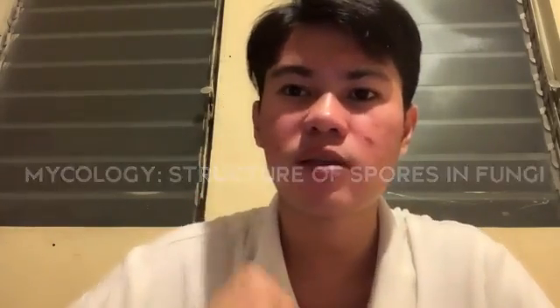Good day, I'm Christian Cabornay, and I'm going to discuss the results in the first part of the activity, which is entitled Mycology Structure of Spores in Fungi. The most basic difference between spores lies in their method of initiation, which can be either sexual or asexual. Sexually initiated spores result from a mating between two organisms, whereas asexual spores result from simple internal division.